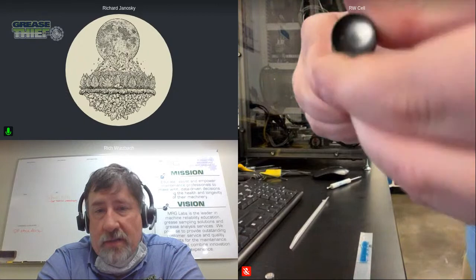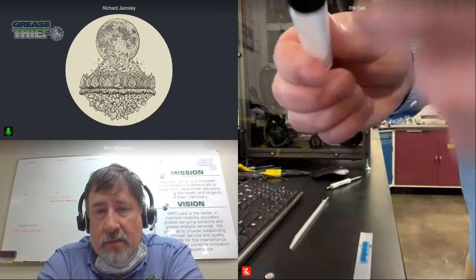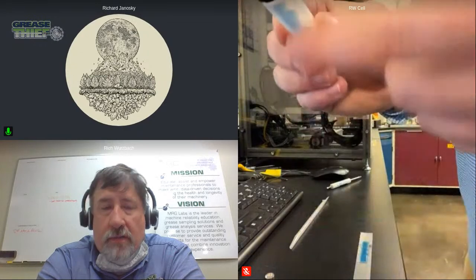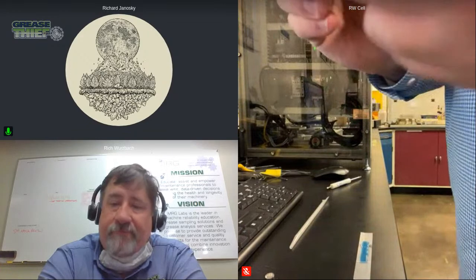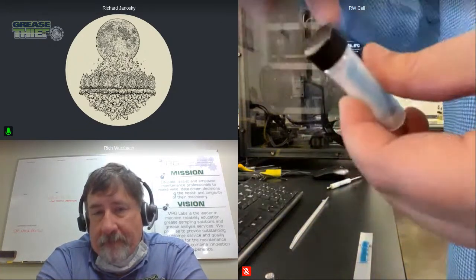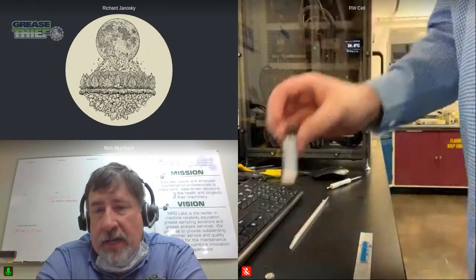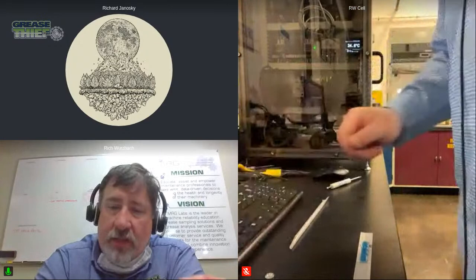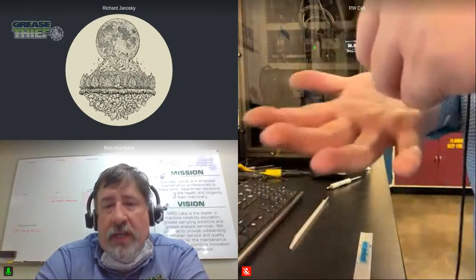So that's another issue that we found in the past when we first started doing this, was that if you didn't put the strip in and you had a blob of grease, that blob of grease would stick out further than the thin film or substrate, and you would end up getting grease caught on the probe as you stuck it down in.